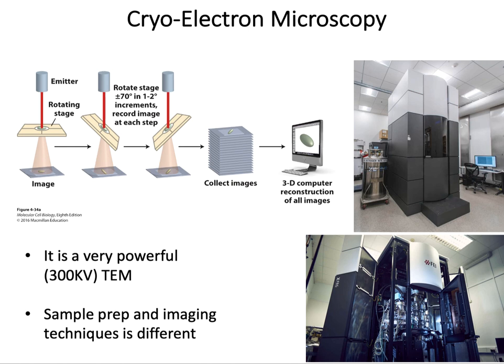So what is vitreous ice? When water forms ice by normal cooling, it forms a crystal lattice, and any living sample with water will be destroyed by these sharp crystal edges. But a rapid cryocooling method does not allow the crystal lattice of ice to form, and it forms a glass-like amorphous ice, or vitreous ice, which preserves the specimen entirely in its original form.